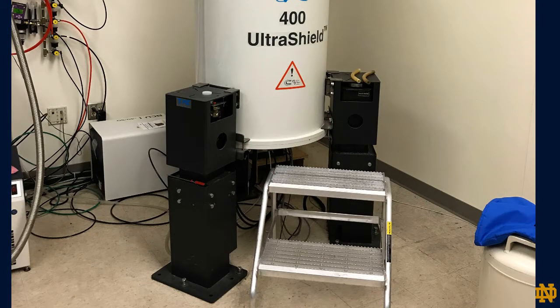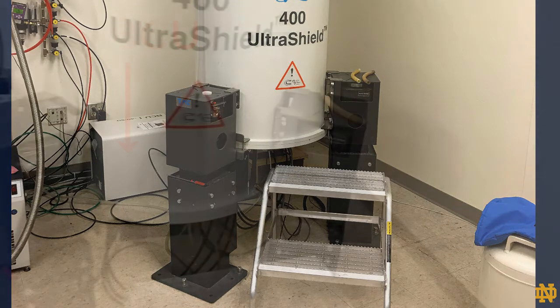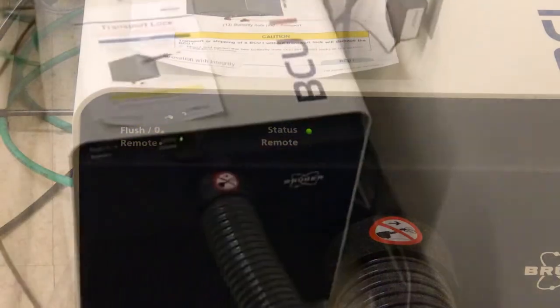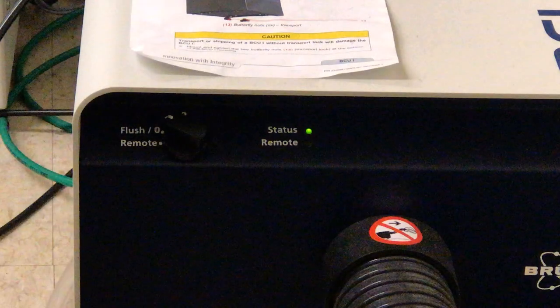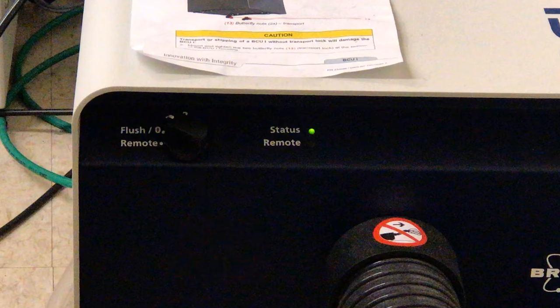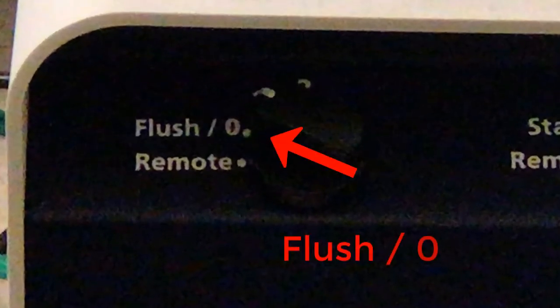Before you begin, you need to verify the current setting of the BCU1. BCU1 is located behind the magnet. Its setting is easier to view if you walk around the magnet to see its front panel. This is a manual unit. The mode switch has four positions. We are checking to ensure that selector is set to flush position or zero.